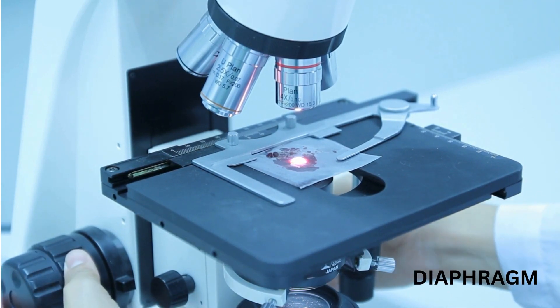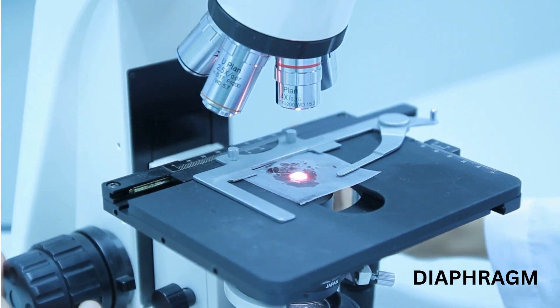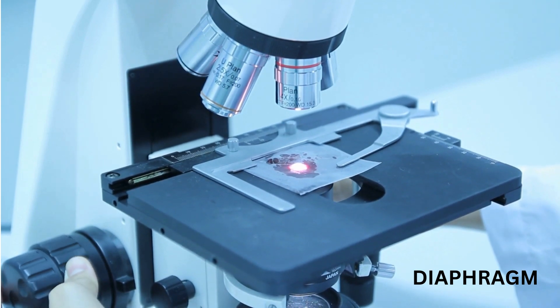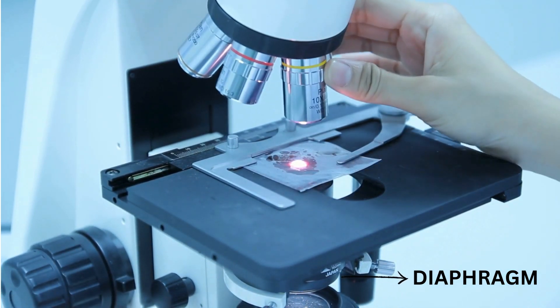Diaphragm. The diaphragm is a part of the condenser and controls the amount of light passing through it. Adjusting the diaphragm can help improve the contrast of the specimen.